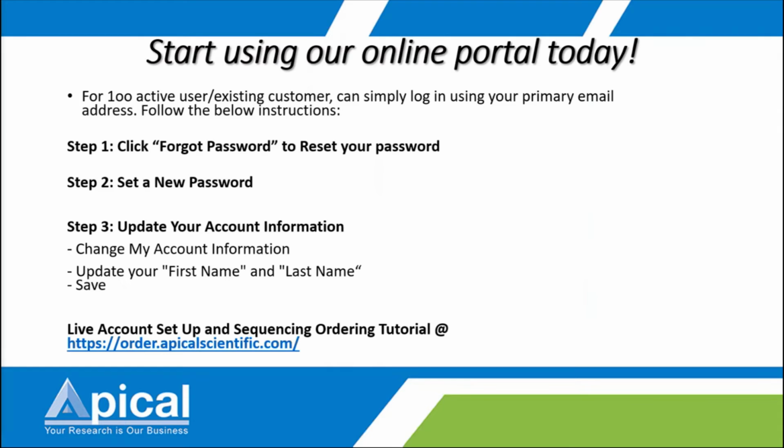All right. And then, okay, this is the most exciting part, where I'll be showing you the live tutorial on how to do the account setup, and also how to place an order through the AO2. All right. So for our existing loyal customers with 100, the active users, you can simply log in to your AO2 using your registered email in 100, and then set up a new account.